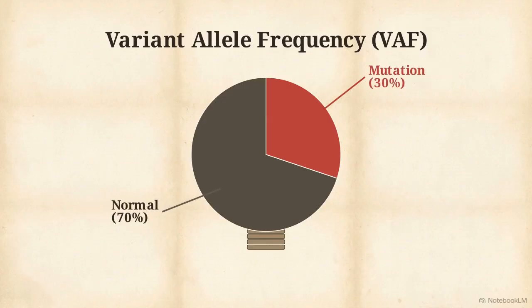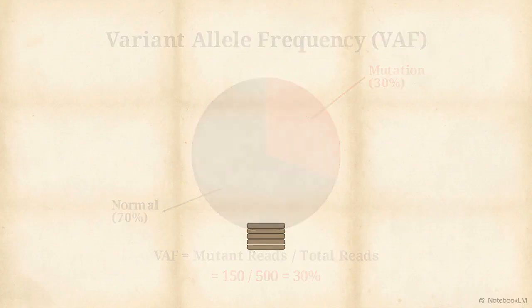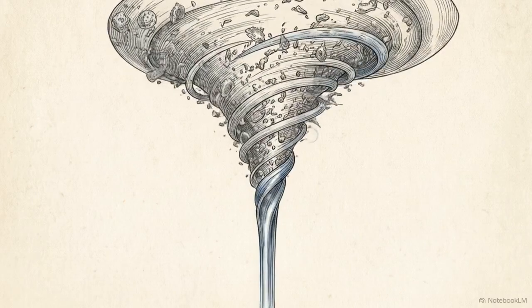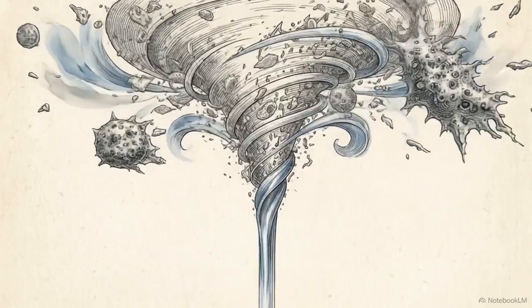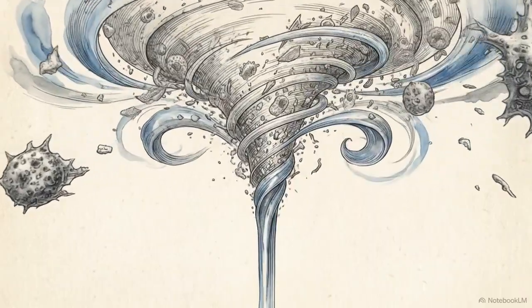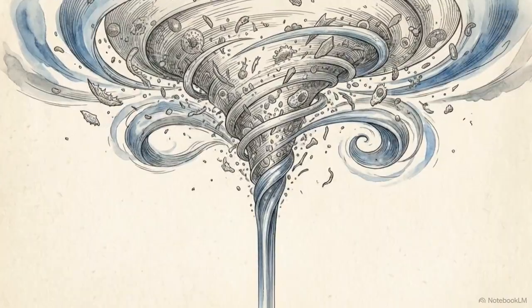This tracks what percentage of those 500 reads carry the mutation, helping to differentiate between true variants and the complex cellular mixture within a tumor. Combining depth with VAF thresholds filters out PCR duplication errors and random noise. Only true mutations are exported into a final, compact VCF file.